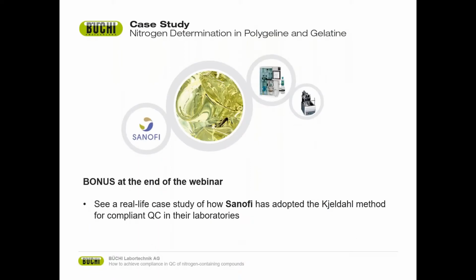And as promised in the beginning of the webinar, now we're almost at the end, and it's time for the bonus. Here you will see a real-life case study of how Sanofi has adopted the Kjeldahl method in their laboratories.